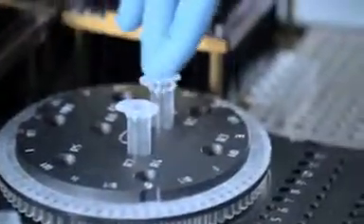The Kiagenity worktable is easy to set up and supports all real-time PCR workflows. This versatile system is compatible with all PCR tubes and plates, including rotor discs used on the Roto-Gene Q.